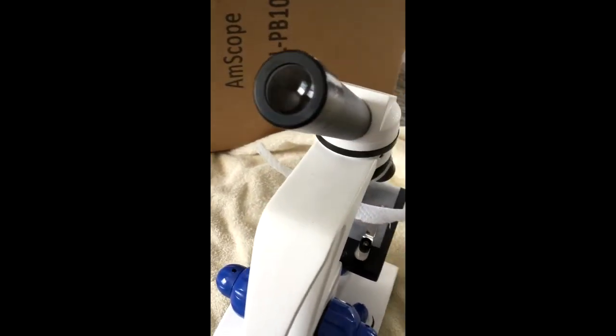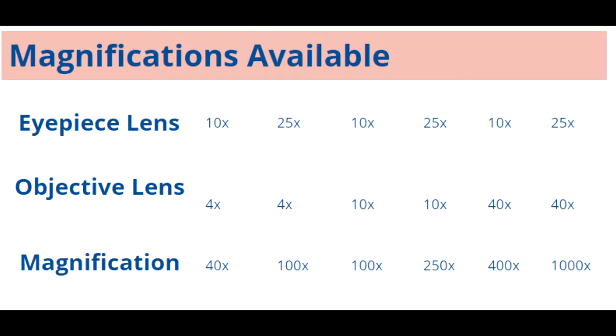Here's how the magnifications work. When you combine the 4x objective lens with the 10x eyepiece, you get 40x magnification. Combined with the 10x objective, you get 100x magnification, and with the 40x, you get 400x magnification. With the 25x eyepiece, you'll get 100x with the 4x objective lens, 250x with the 10x objective lens, and 1000x with the 40x objective lens.